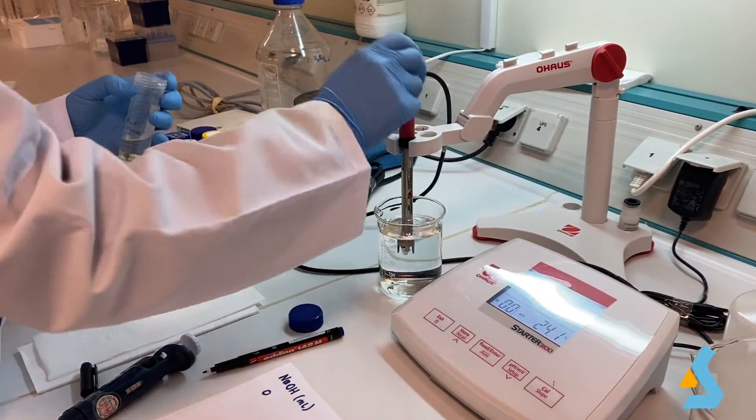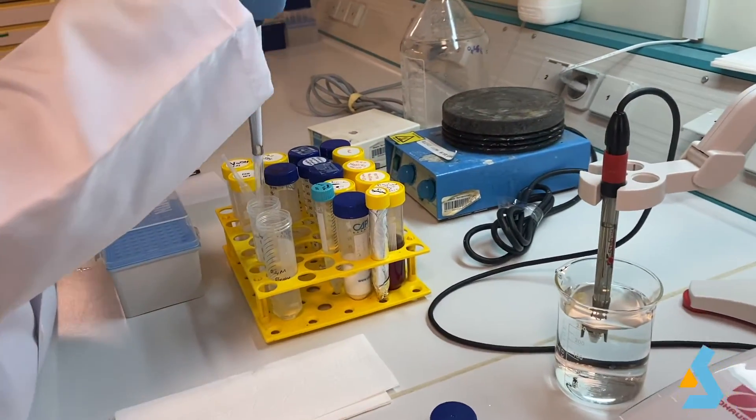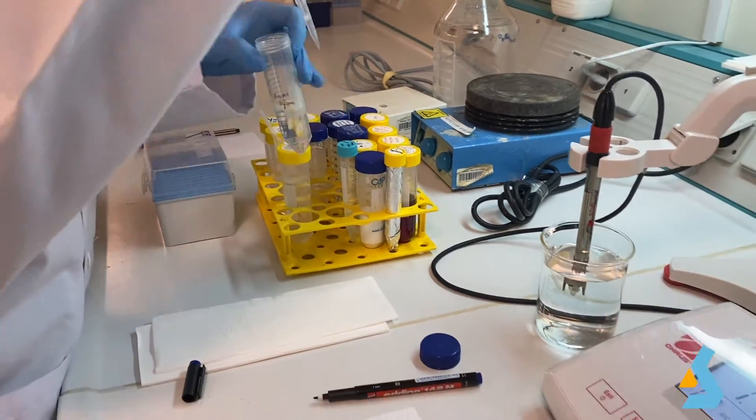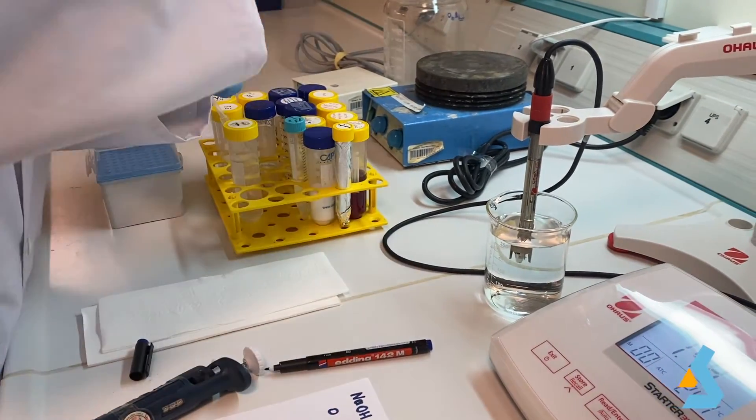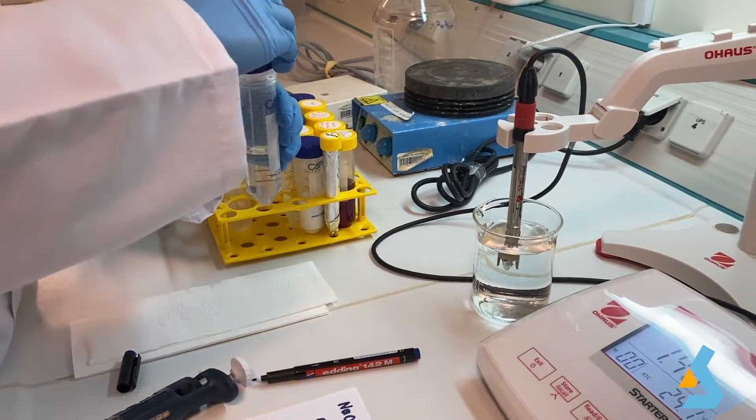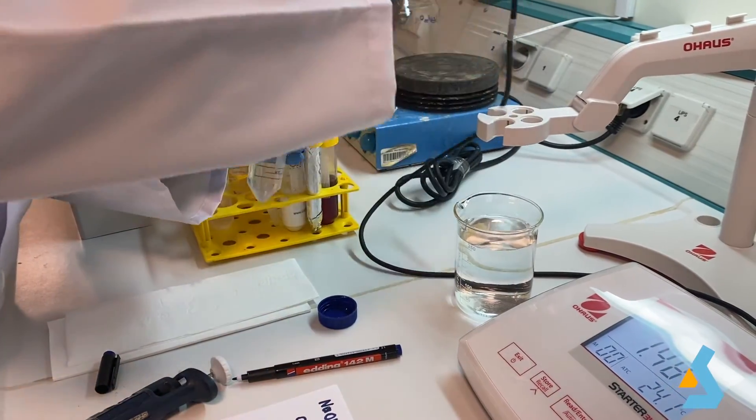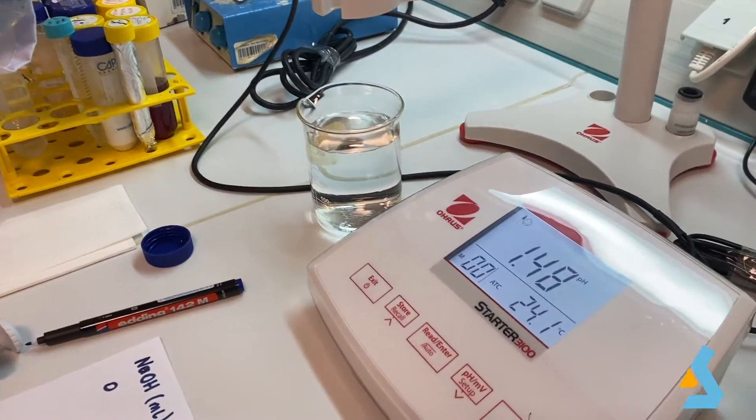We will add 0.5 ml portions of sodium hydroxide, mix the solution in the falcon by inverting, then measure the pH and finally write down the findings to tabulate the measurements. This addition will be repeated consecutively until the pH reaches around 12. This should give us enough data to plot the titration curve.